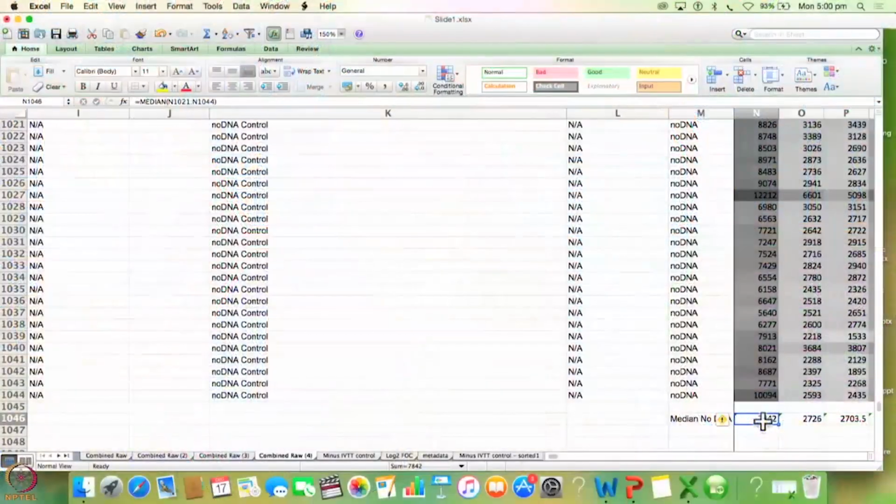The first thing we're going to do is take a median of this, which I have already provided here. This is the formula for it. I've done the whole thing in Excel, so now we have a median value here.